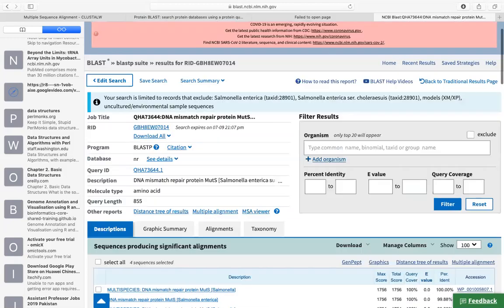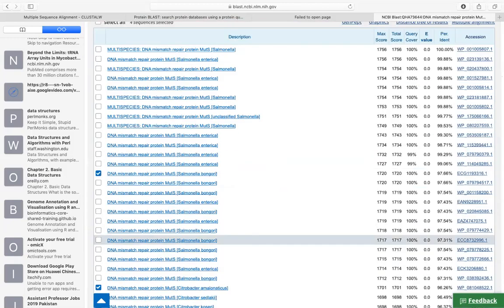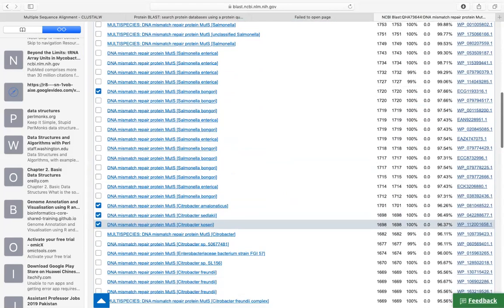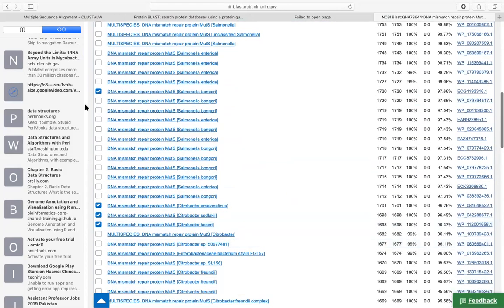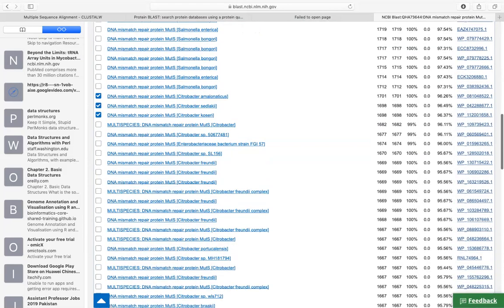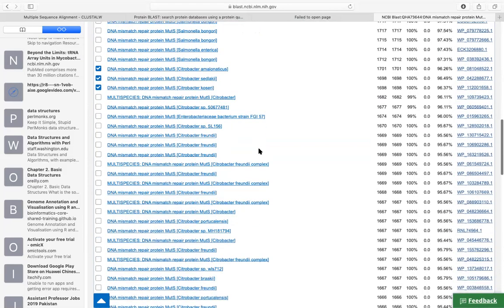This work is long, but we need to take you to the other tool. That's why I have just done three or four sequences. If I select only one, the software will not run multiple alignment — you need more than two. So I have selected three or four sequences, and I have also checked their parameters.